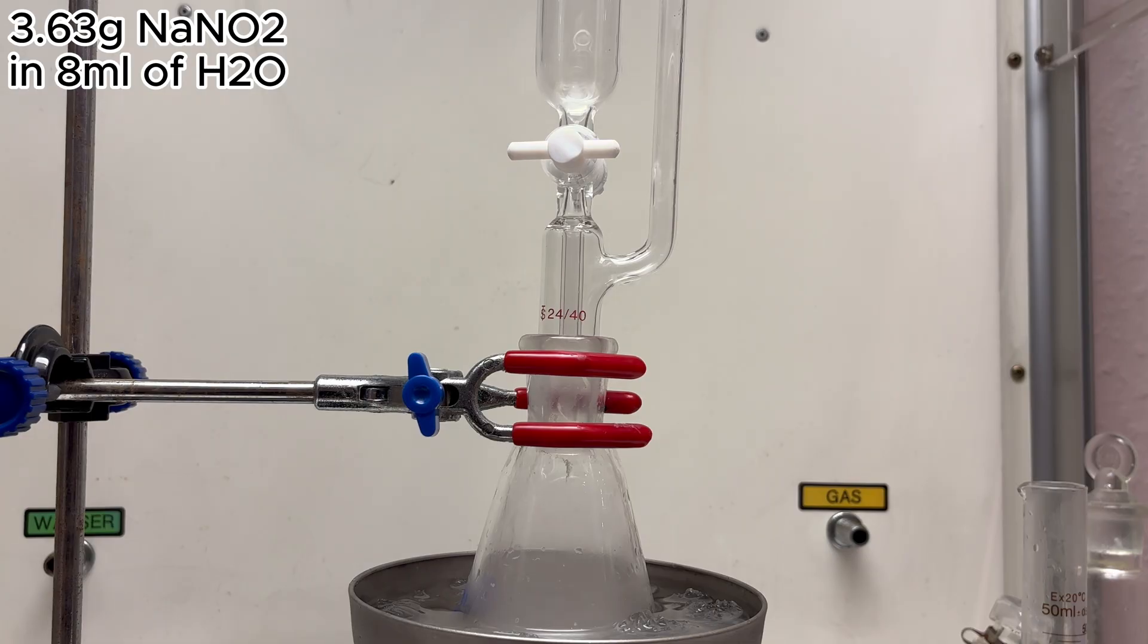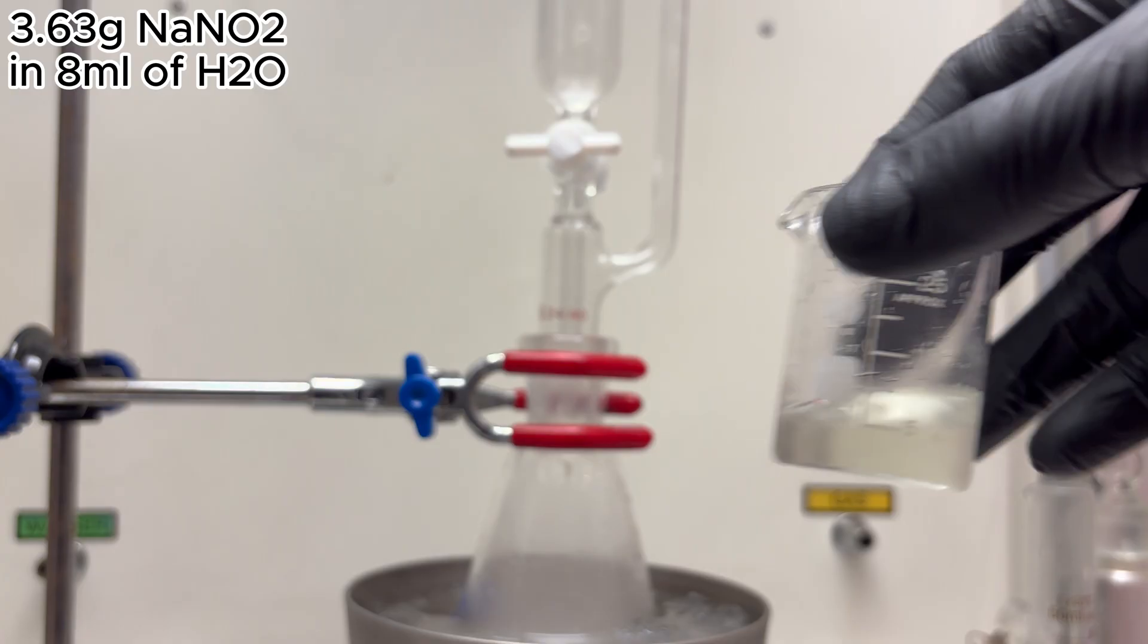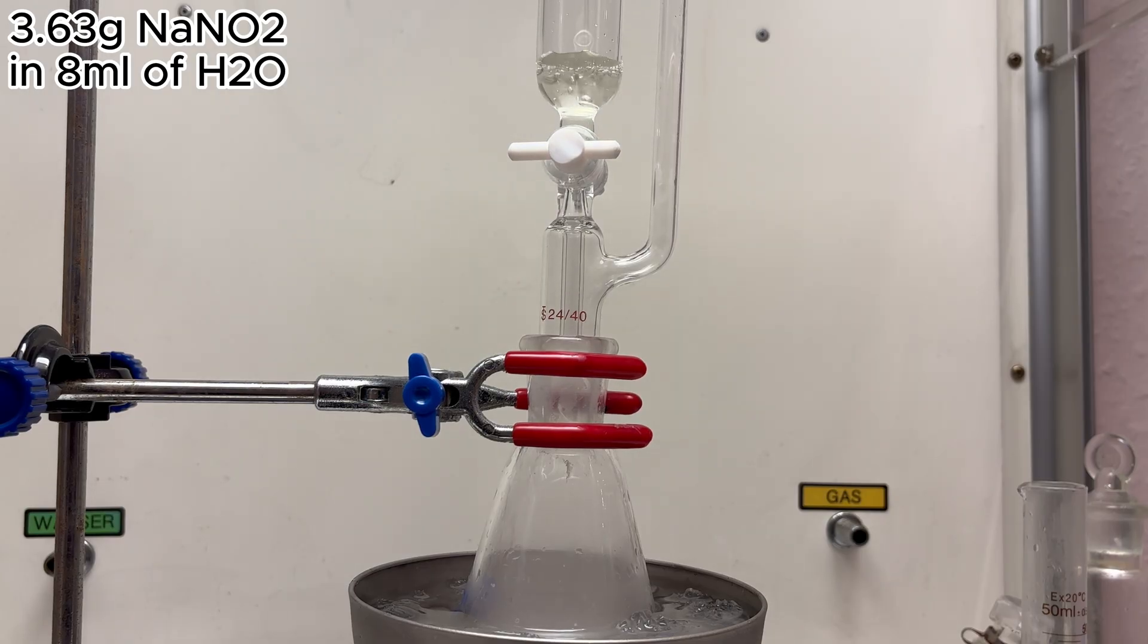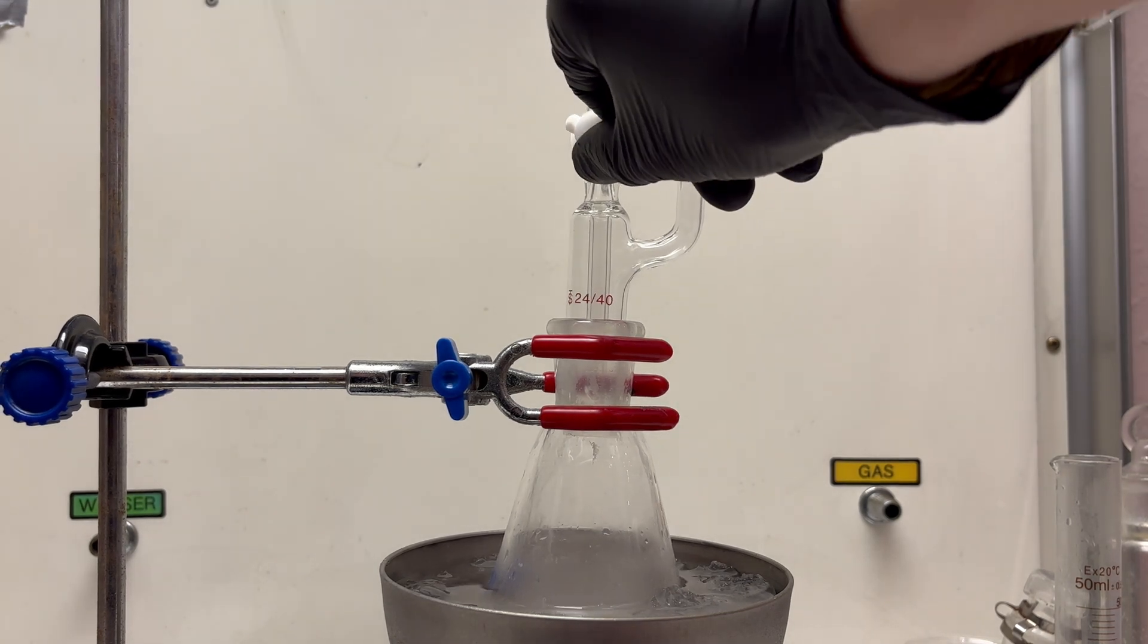Now we will add a solution of sodium nitrite into an addition funnel and let it drip into the reaction mixture very slowly. It's important to hold the reaction mixture at 0 to 5 degrees Celsius.